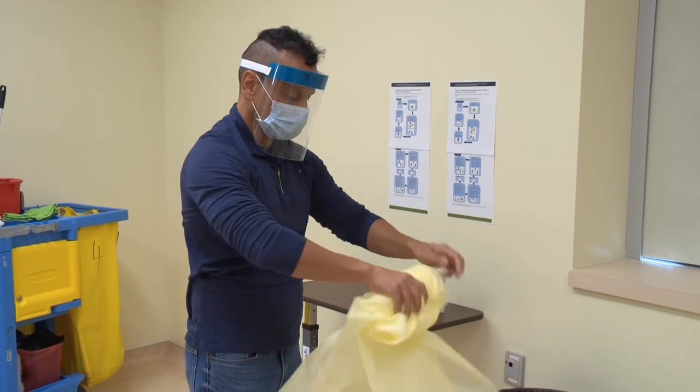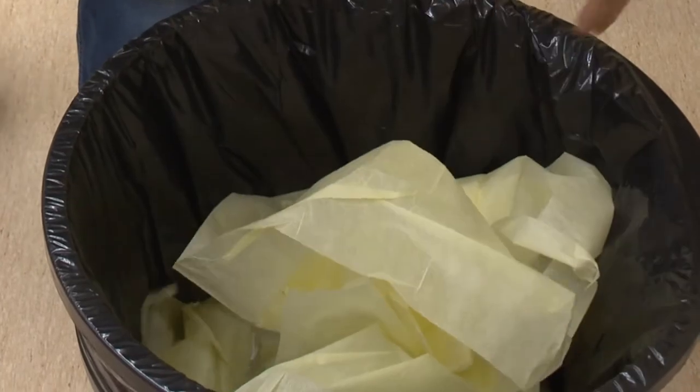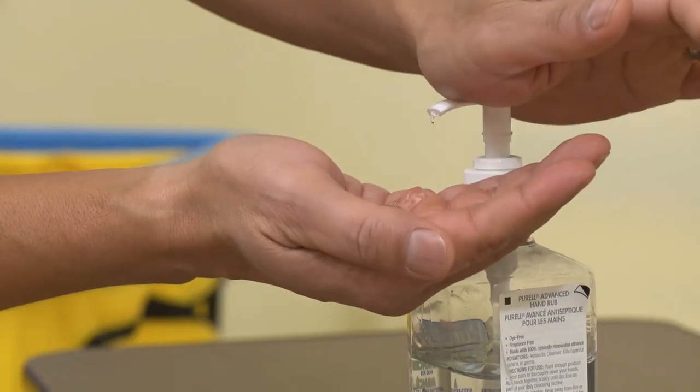Slowly roll the gown inside out into a loose ball, making sure you do not touch the outside of your gown. Put the gown into the waste container and perform hand hygiene.